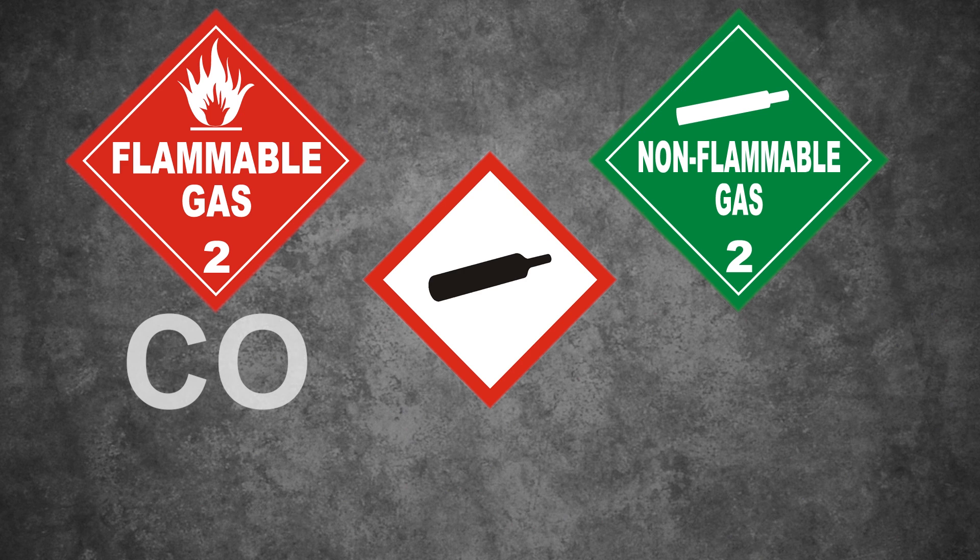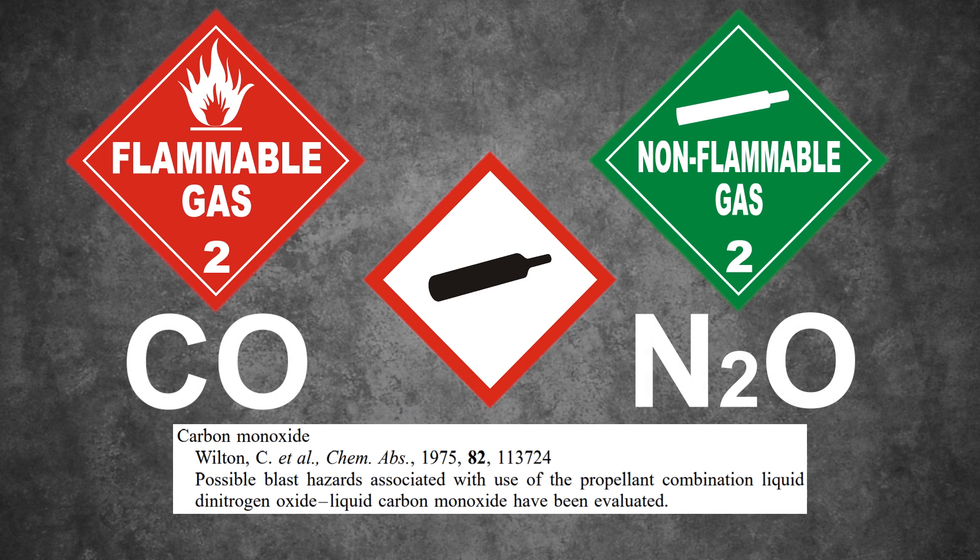The first reaction is the one of liquid carbon monoxide with nitrous oxide. One of the articles says that this reaction will be very interesting. So, let's look!